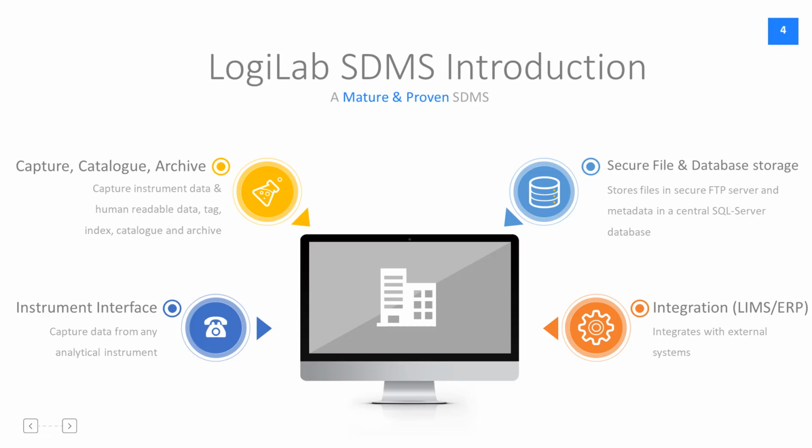Logilab SDMS is a secure file storage system. It stores all the files in an FTP server in a secure manner, and any metadata related to the files are stored in a SQL Server database, and both the data and metadata are in a central server.